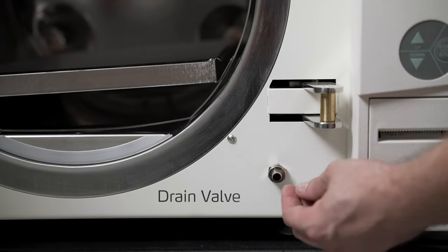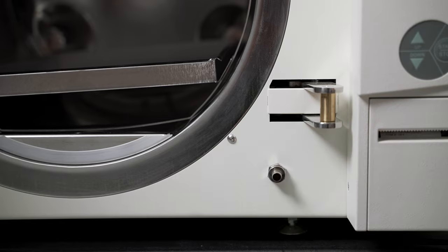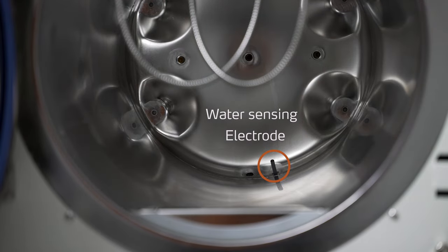Right below the locking arms we have the drain valve for flushing and refilling of the reservoir. And in the chamber, all the way at the very back bottom, is the water sensing electrode for monitoring the actual water level in the chamber during sterilization.